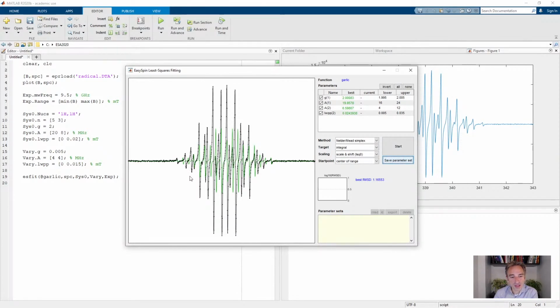The trouble here is that some of the simulated line positions are spot on, like this here, or this here, or this here. And also in here, there are some that fit really nicely, here and here. But the fit is only partial. But it's good enough partially that this forms a local minimum in the error surface. And as a local minimum, these local search methods have no way of getting out of it.